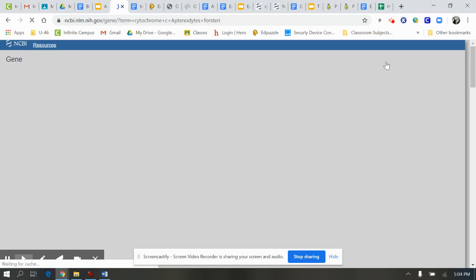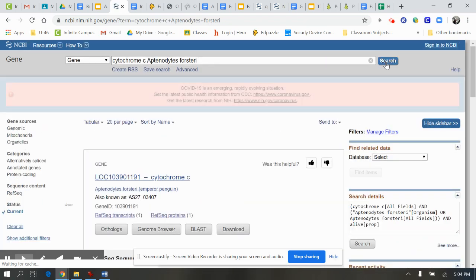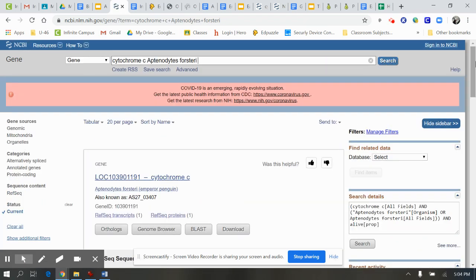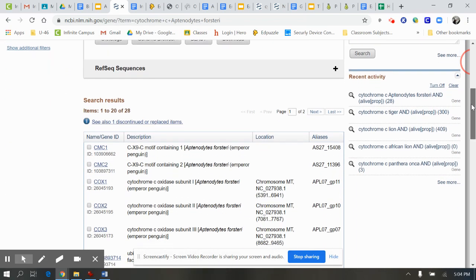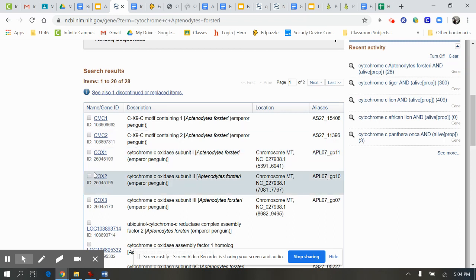And Mr. Novick and I have included a document for you to enter your data, very similar to the table I have in my slides. It says you're going to look for a code called COX2. Any of these COX codes go with cytochrome C. Basically, that's a protein found in the mitochondria. So a lot of former words from earlier this year are coming back into the picture.